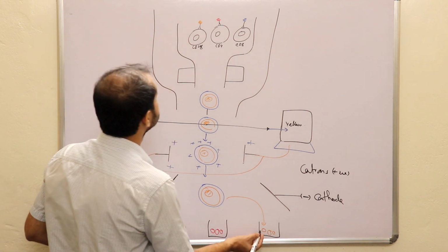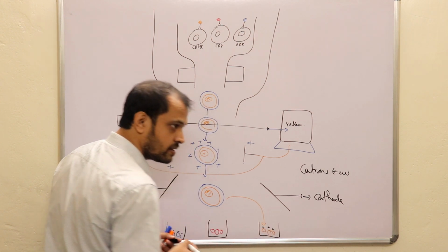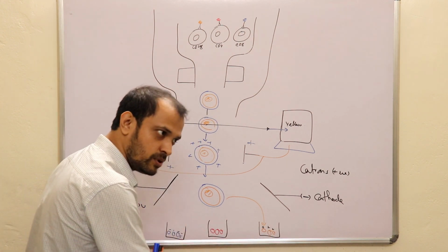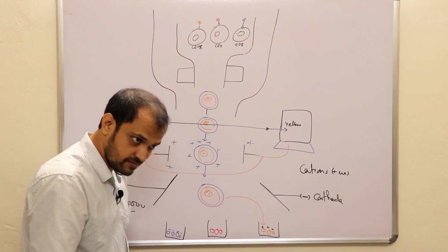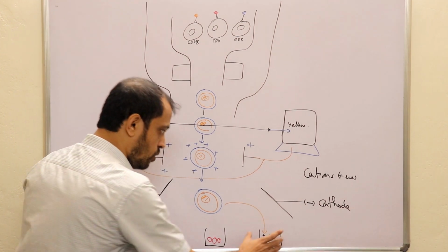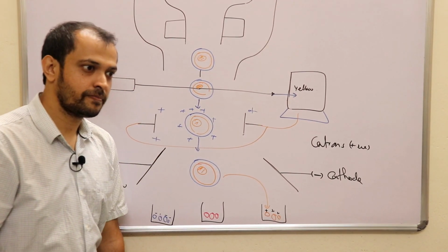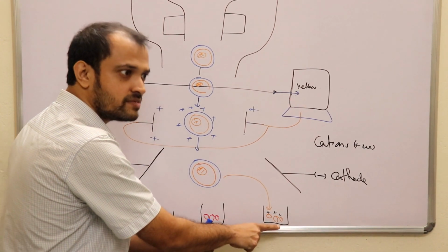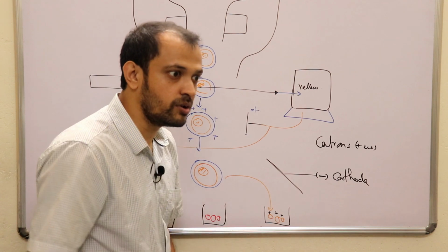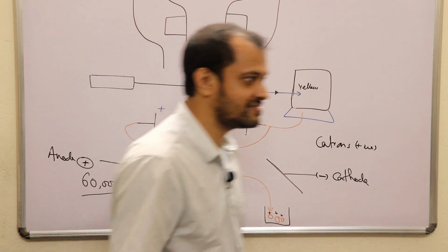And this is the CD28 positive cell population. They are all positively charged, right? Now, if you are in a lab utilizing this type of system, once you touch this tube, you will get a shock. Why? Because there are too many positive charges, and these charges are not discharged.